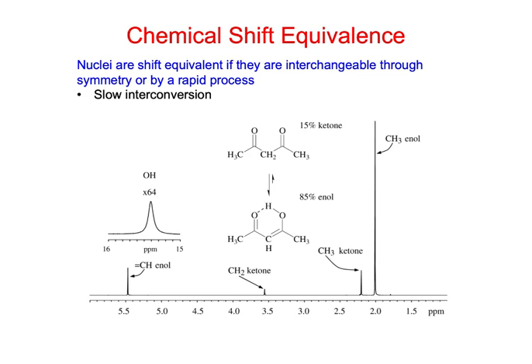Okay, so the other thing, and when I was looking at it, this ended up not really being the best slide for what I was maybe trying to show here, but chemical exchange processes can also affect what we see in the spectrum.